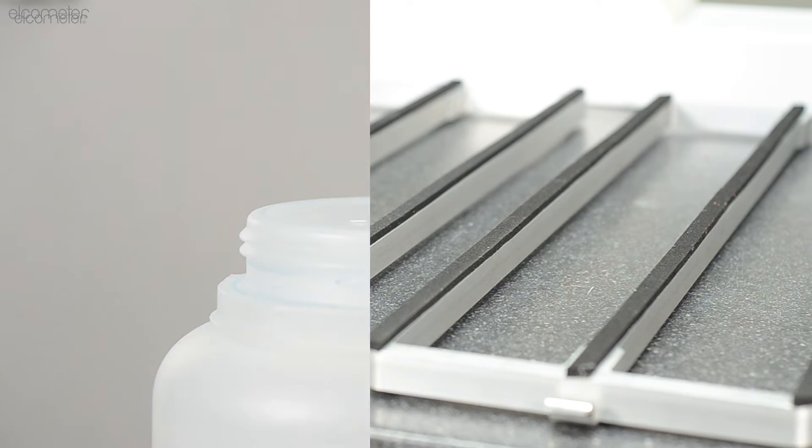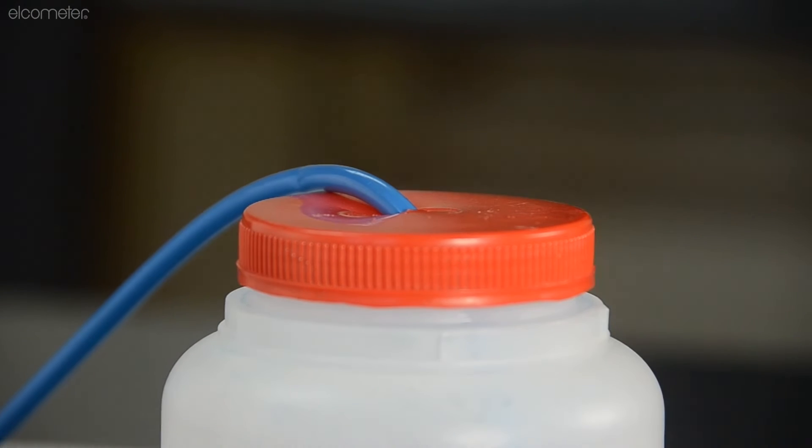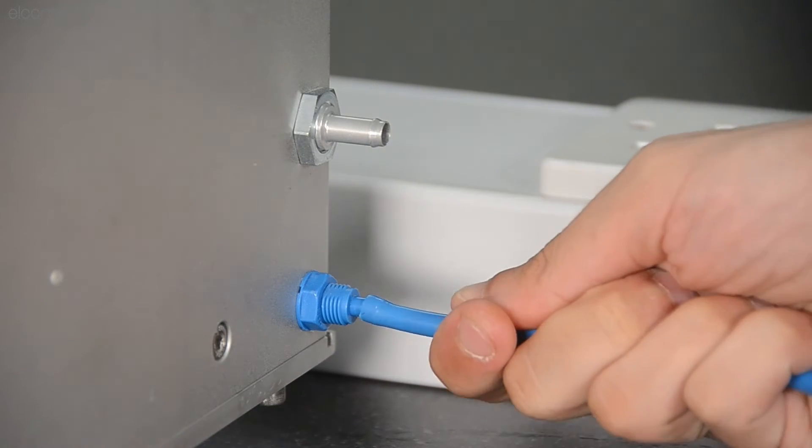Add your desired liquid into the container, ensuring the intake tube is pushed to the bottom of the container. Then, connect the other end of the intake tube to the blue connector at the right side of the tester.